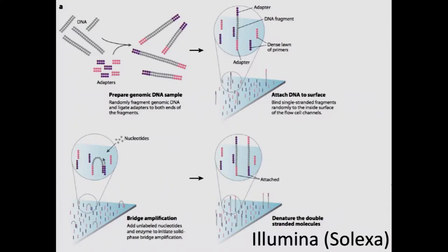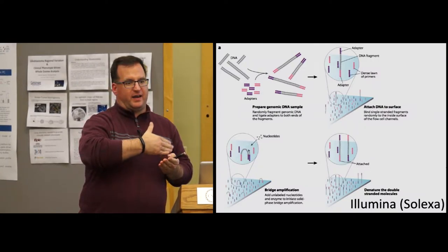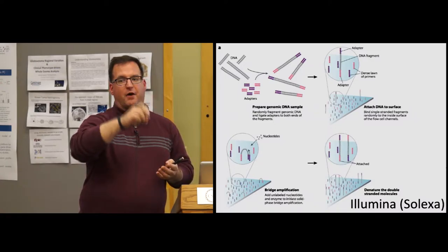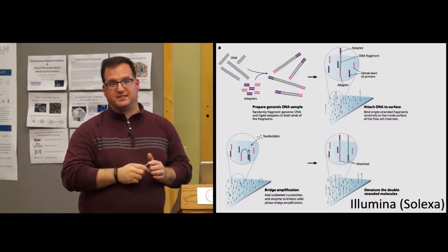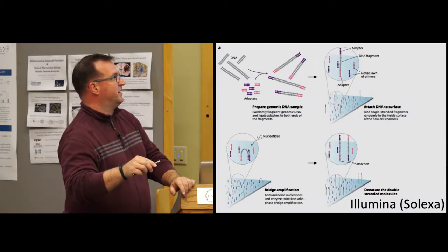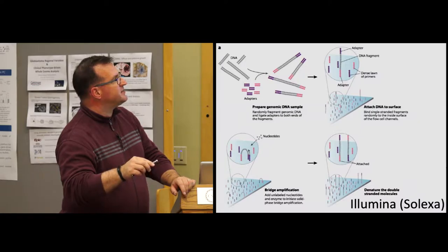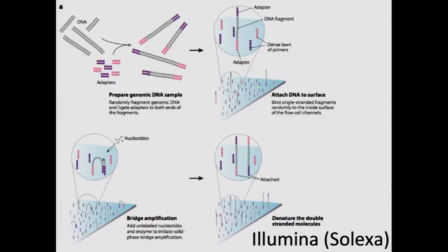Okay? And I always like to explain this because I think of it this way. It's like plating out E. coli or yeast. You're going to plate it out at a low enough density that you can allow individual colonies to grow up. And that's exactly the sort of thing that's going to happen here. So on this plate, you can hopefully see that here's a single molecule of DNA that's annealed, and then spatially separated on the plate is another molecule, and here's another molecule, and in between there's nothing.